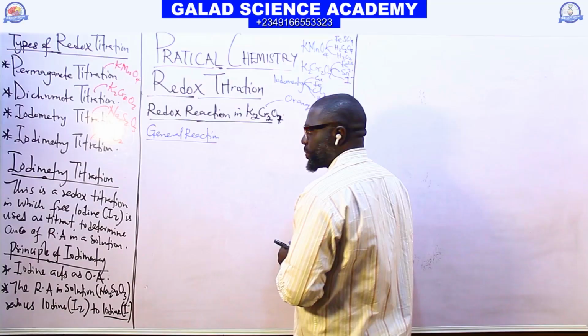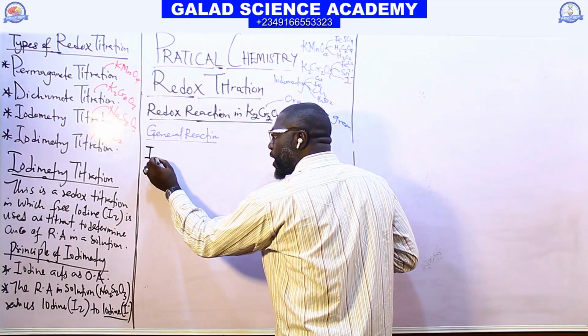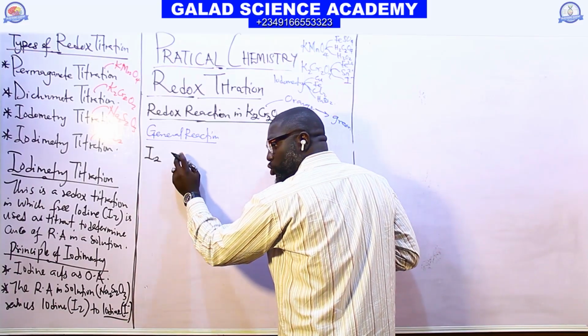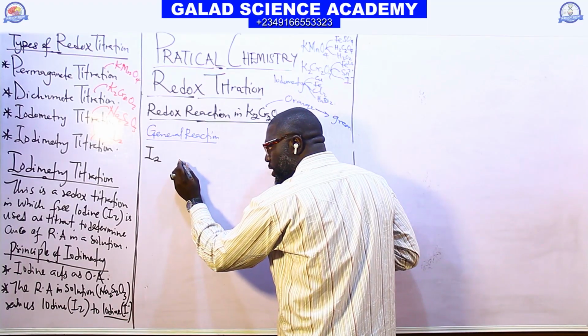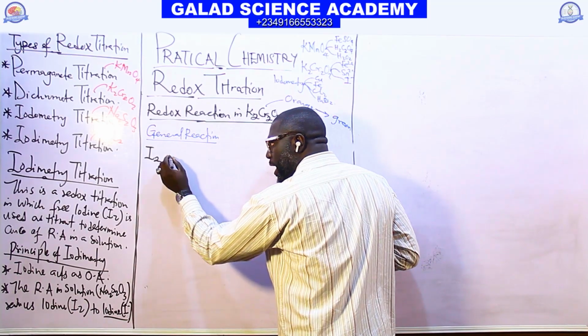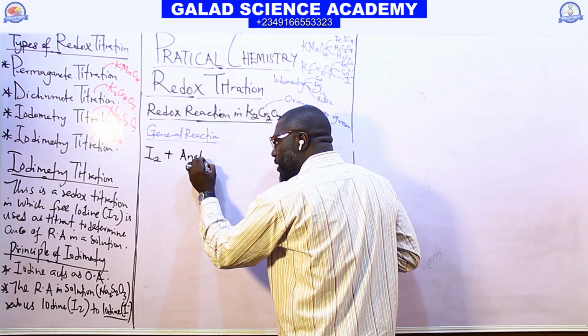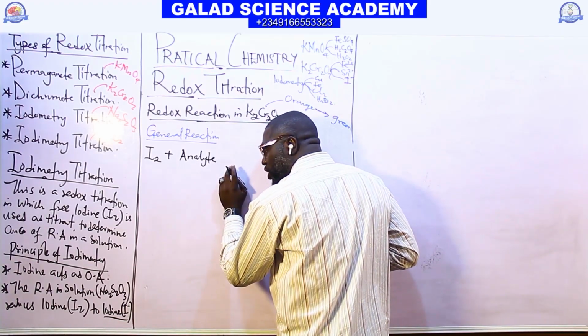So I said we have iodine (I2) plus analyte, of unknown concentration.